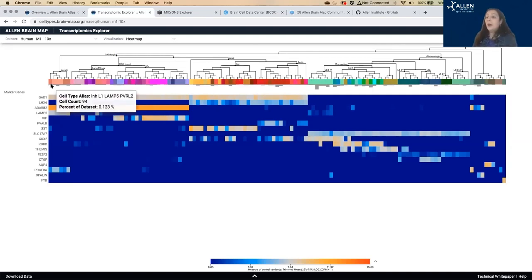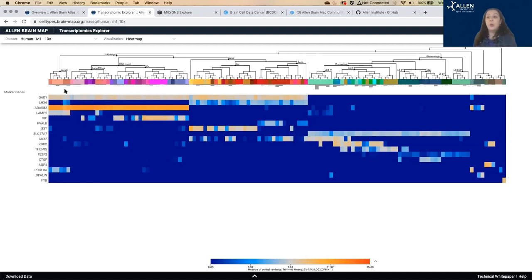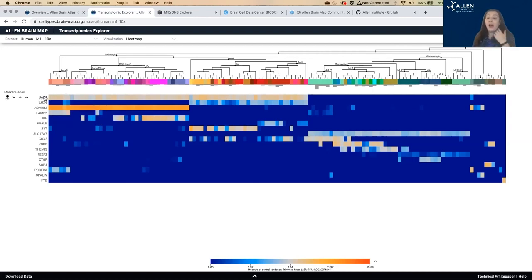So each of these columns represents one cell type. And then each row here represents one gene. And the color is telling you the average expression level of that gene across all of the cells that fall into that cell type.